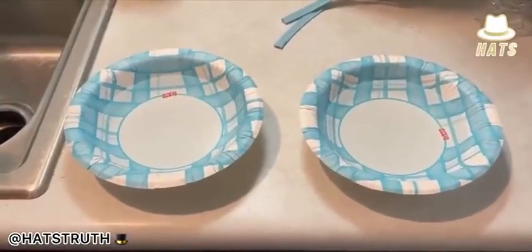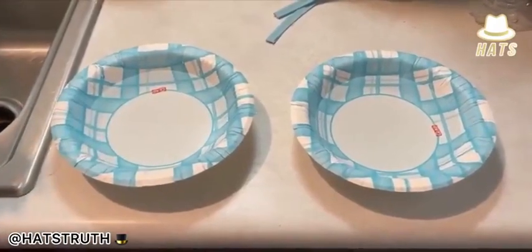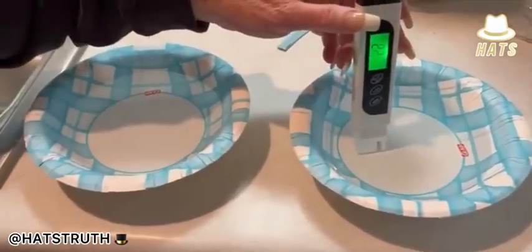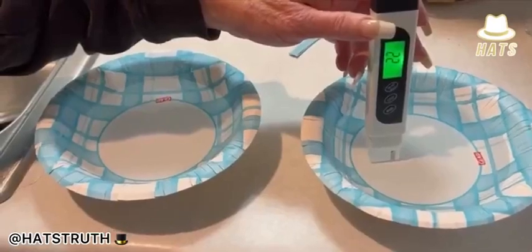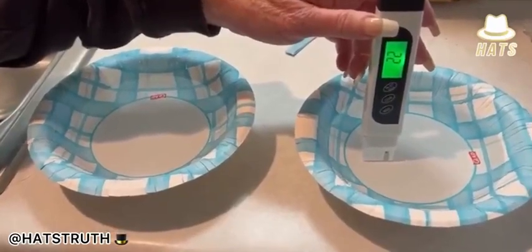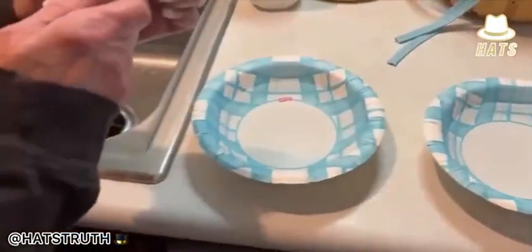When testing water, on the left is tap water and on the right is bottled water. The bottled water tests at 22 — that's good, it's in the green level. Now let's test the tap water.